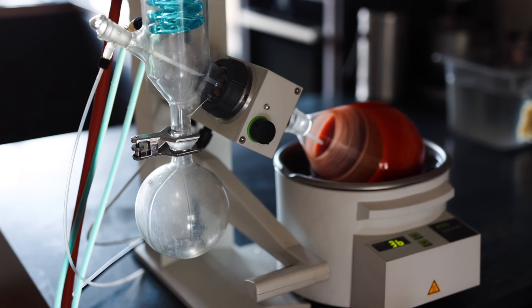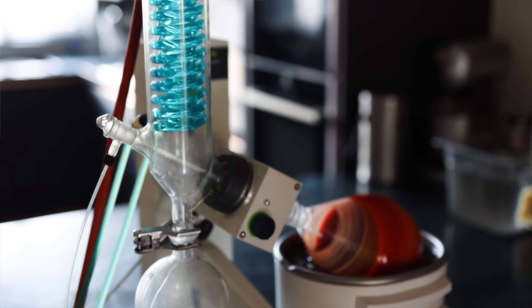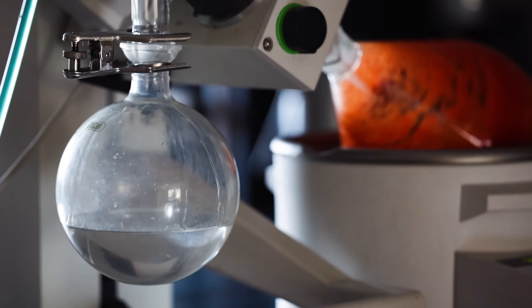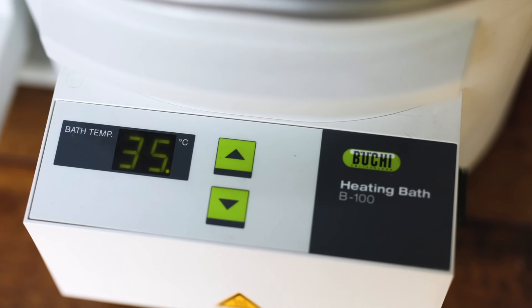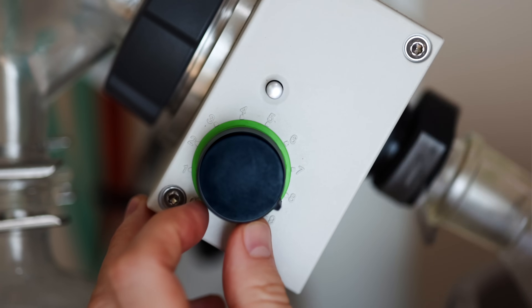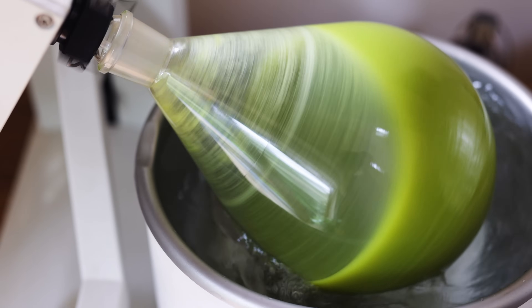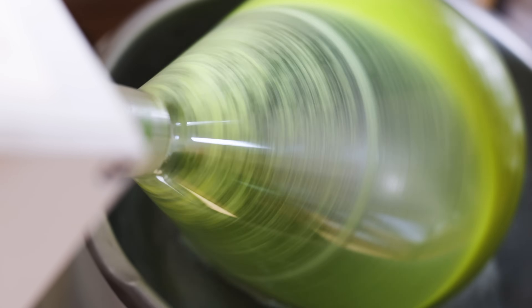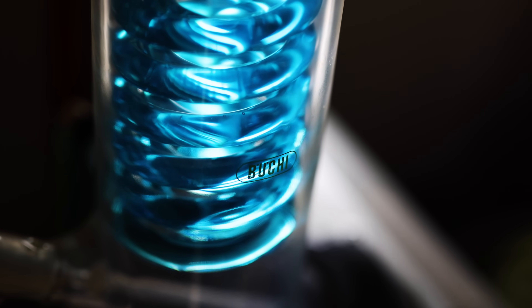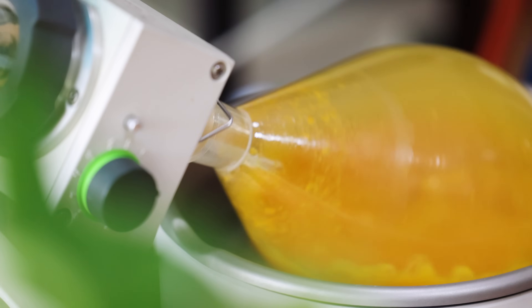To more fully understand the Rotavap, you need to understand that this is a system made up of three parts, and you need all three working together to do the sort of low temperature work I use it for. There is the Rotavap itself — the glass still — with a flask that is lowered down into a temperature-controlled bath. For my low temperature work I'm usually running that water bath at about 30 to 35 degrees Celsius. This flask can be rotated in the water bath, giving a larger surface area to any liquid within it, which gives more efficient and rapid evaporation.